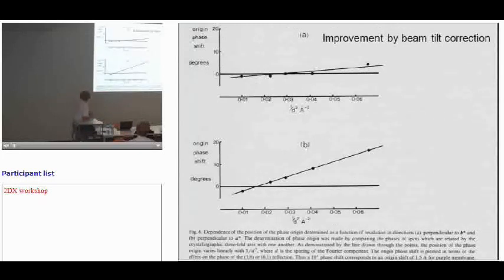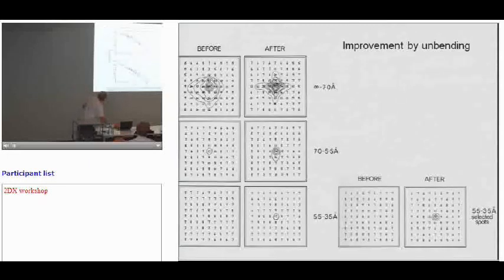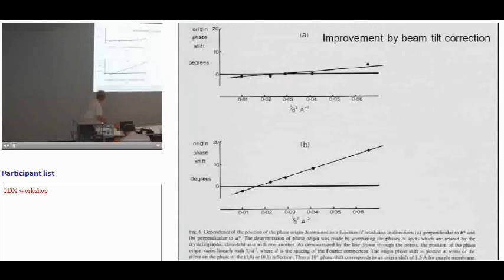And then the next slide shows this business about beam tilt. What happened was, in these unbent micrographs, we got these spots. You could see them. You could read off the phase, and you'd make a list of the phases, and they didn't agree at all. They were completely random numbers, actually. And what that showed was that it's very important to have good enough diagnostic techniques that you can prove that what you're doing is right. Because before all this work was done, there's another paper that not many people have read, and it's best forgotten, except as a lesson. And it was Steve Hayward and Bob Stroud.